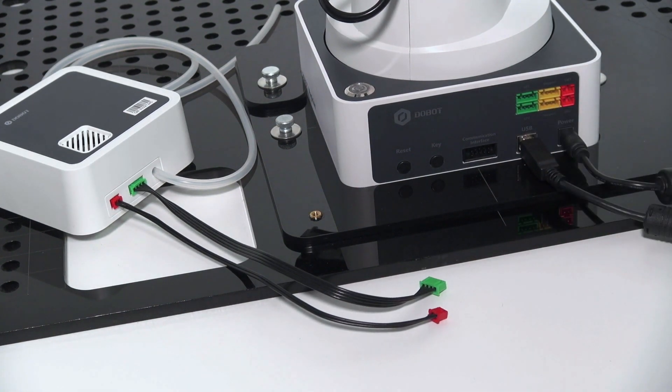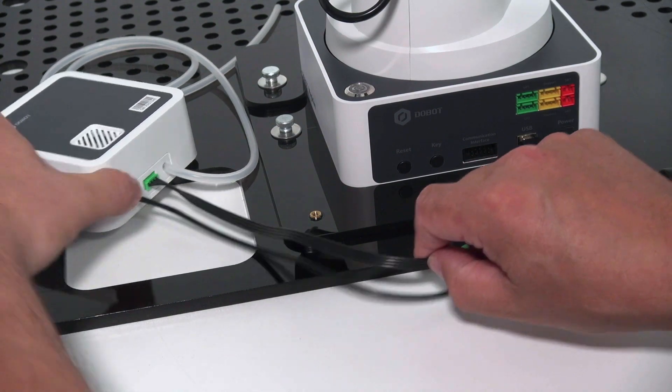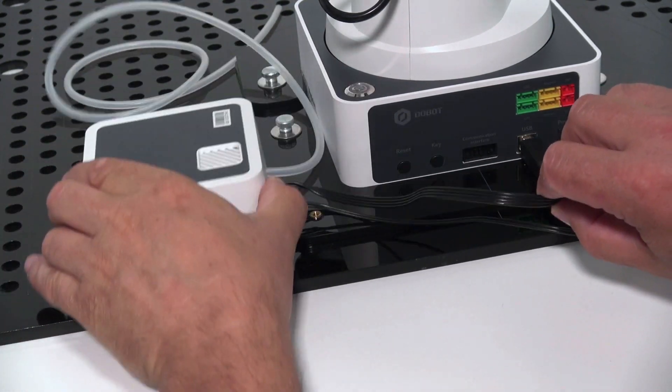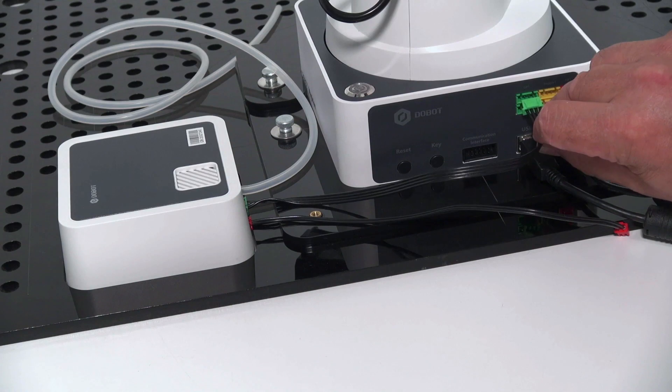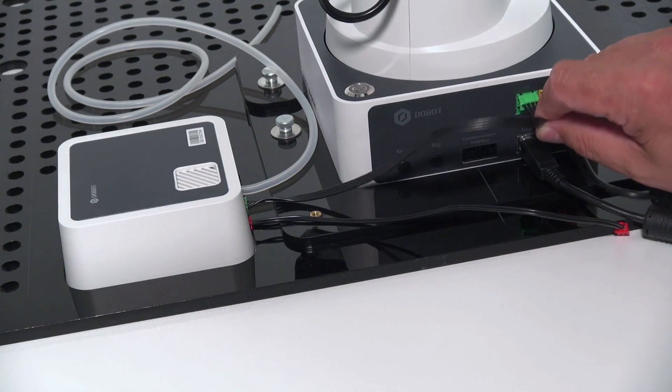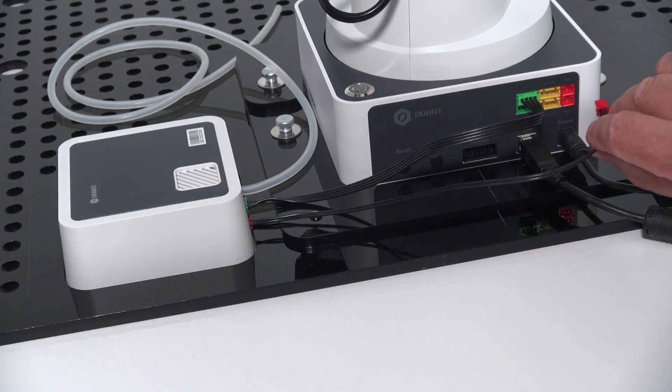The air pump you're gonna use later is connected via two plugs. The green one is for the controls, and the red one for the power supply of the pump. Use the upper connections.